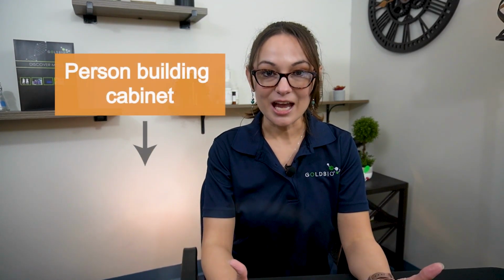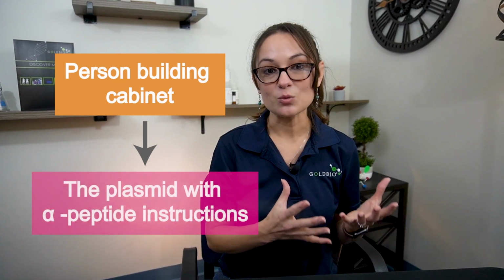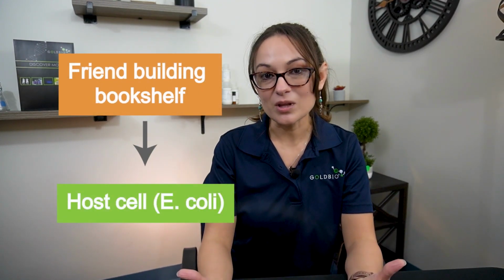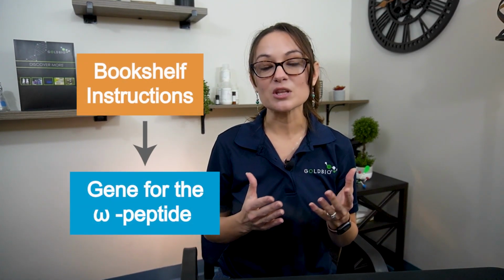Before we go deeper on this, I just want to map the players of our bookcase analogy to the blue-white screening process. You, the person building the cabinet, would represent the plasmid with the alpha peptide instructions. See video part 1 on that one. Your friend who is helping build the shelving section would be like our E. coli cloning cell, and their set of instructions would be the cloning strain's genome that carries the sequence for the omega peptide, the peptide with a missing piece in it.